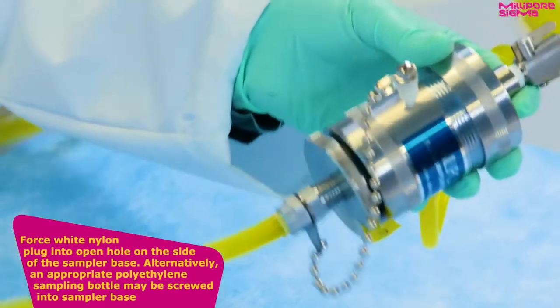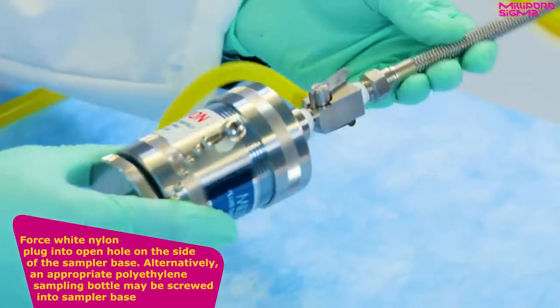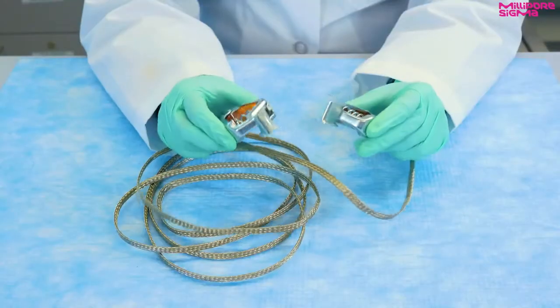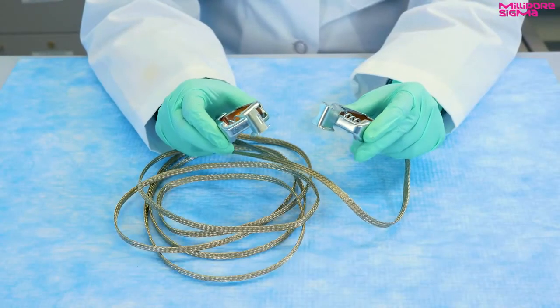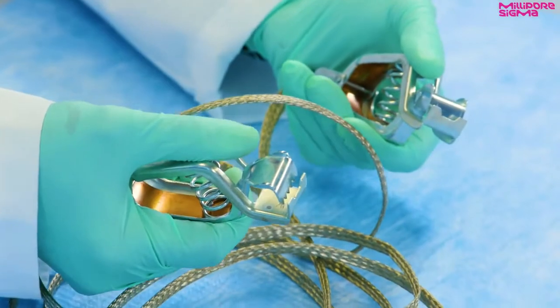Alternatively, an appropriate polyethylene sampling bottle may be screwed into the sampler base. An additional grounding wire is included in the kit if needed. Be sure to ground your setup to ensure your safety.